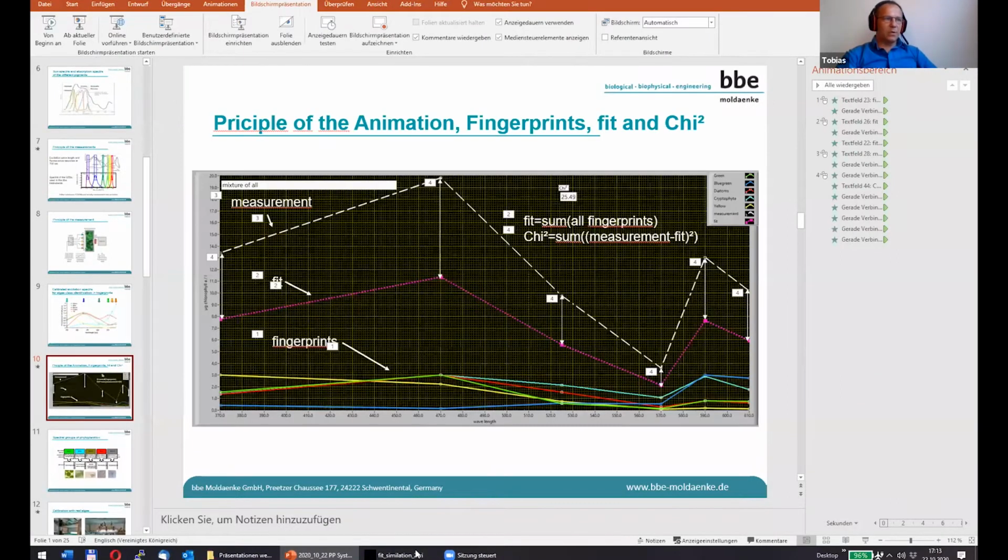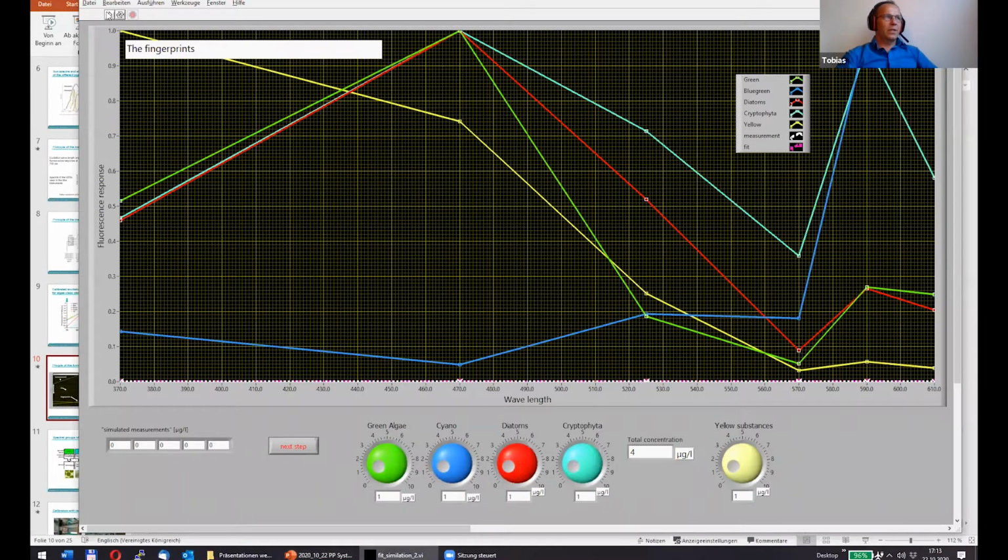Yes, I will start with my animation. You have seen it already. We start with the fingerprints of our instrument. You have the yellow substances, the yellow line, the green line, the red are the diatoms, the cryptophyta, and the blue are the cyanobacteria.